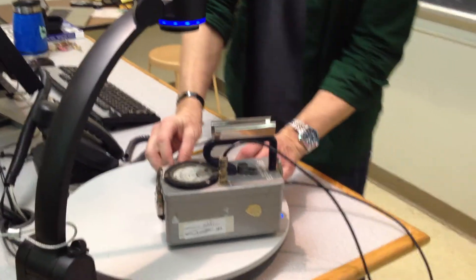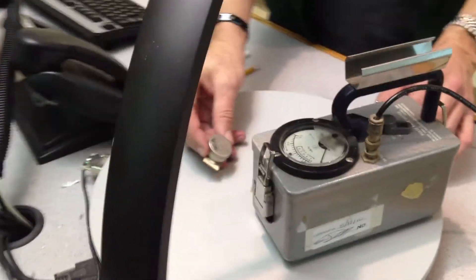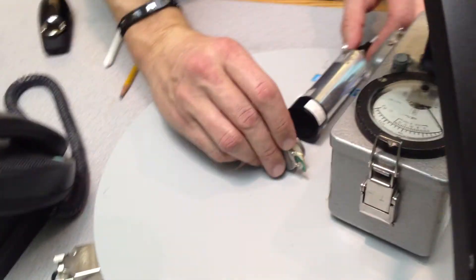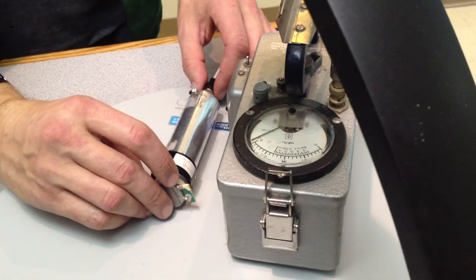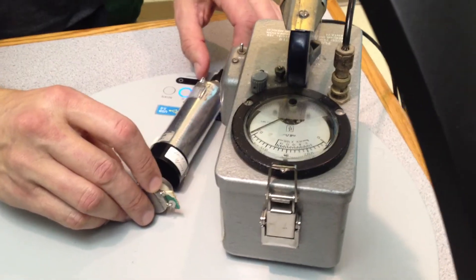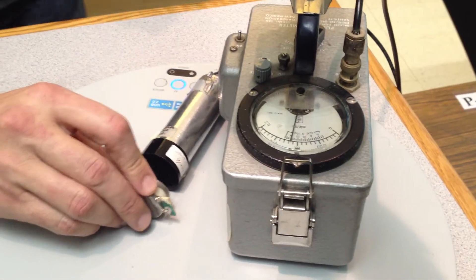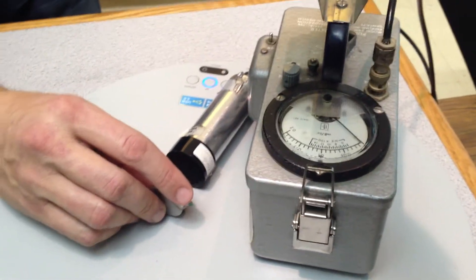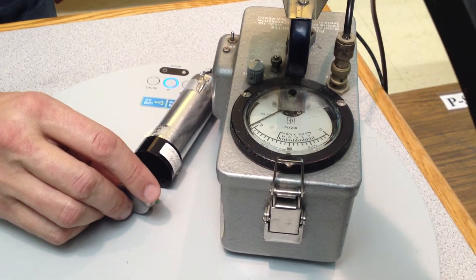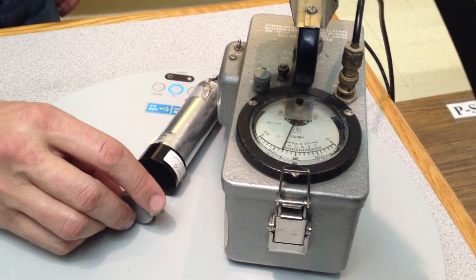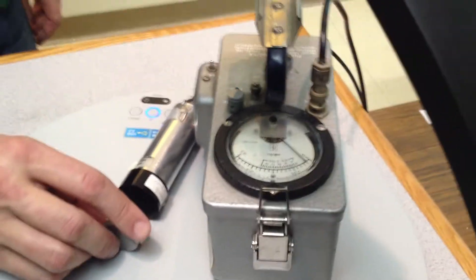There. So, here is the source. There's the detector. Whoa. And the crowd goes wild. Alright. So, you'll notice this source of ionizing radiation doesn't travel through air very far, does it?